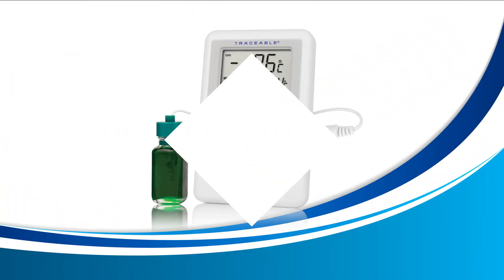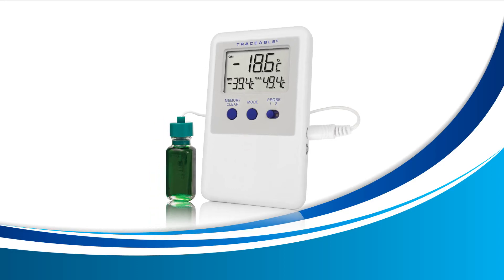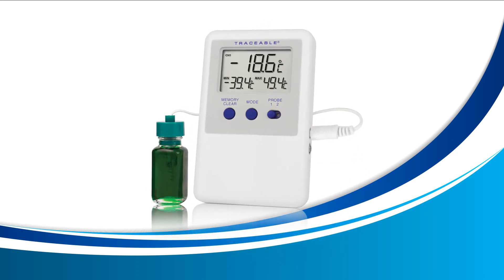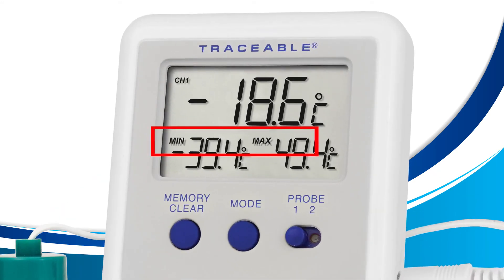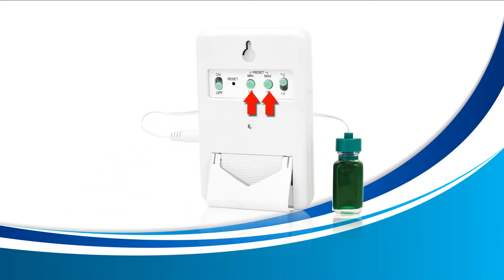Clearing your min and max individually. For your last lesson on min and max, we're going to learn how to clear the min or the max individually. To do this, we're going to use the mode button on the front of your device, and also the min and max buttons located on the back of your device. First, press the mode button until your screen displays the words 'min' and 'max' as shown. Then turn your device around and locate the min and max buttons on the back of your thermometer.